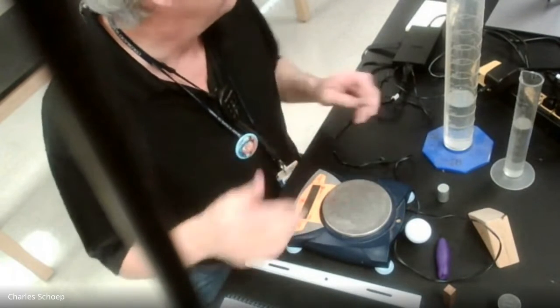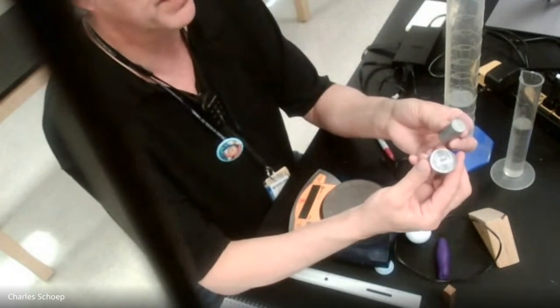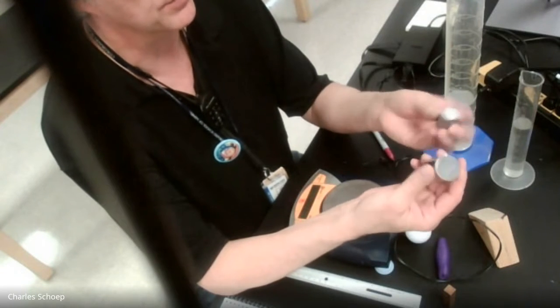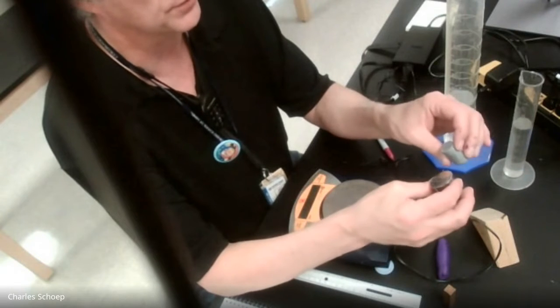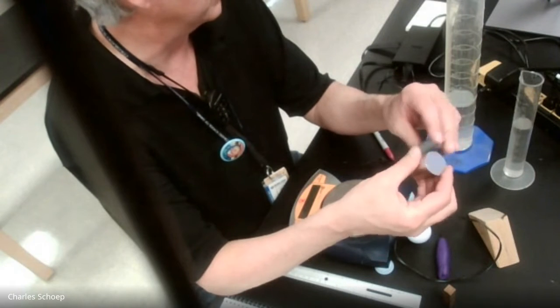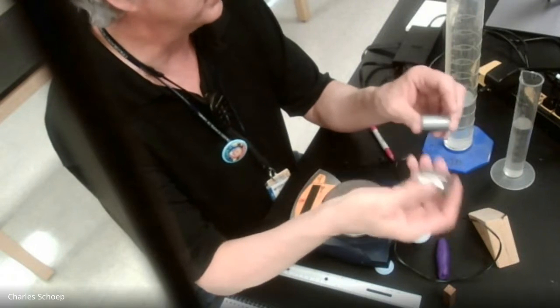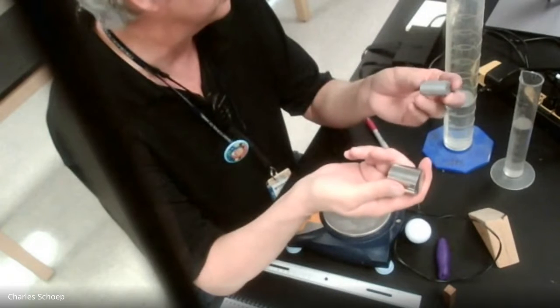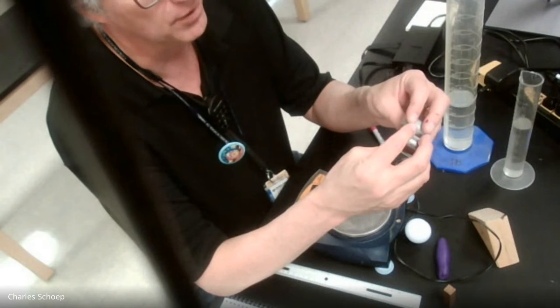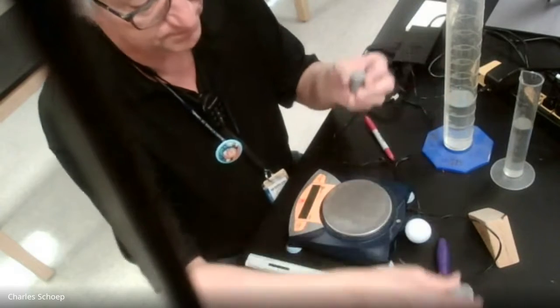Now, maybe something we want to test is, are these two metals the same metal? Even though this guy's shiny, maybe this is just polished. So let's see if these two guys are the same metals. One of the ways we could test that is to find out if the density is the same. That wouldn't be a guarantee, but if the density wasn't the same, we would know that these aren't the same two metals. Now, if they have the same density, they're probably the same metal, but they could be different. But if they have a different density, we know they're not the same metal.